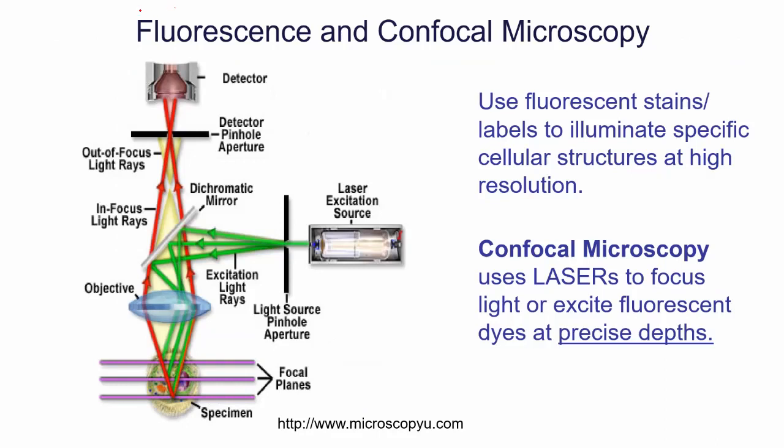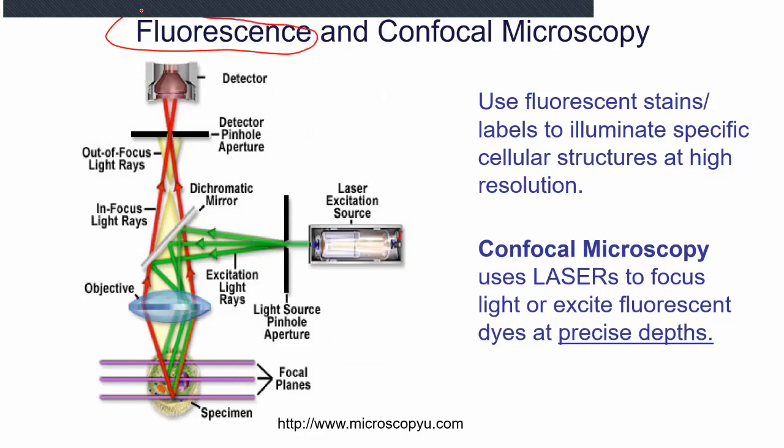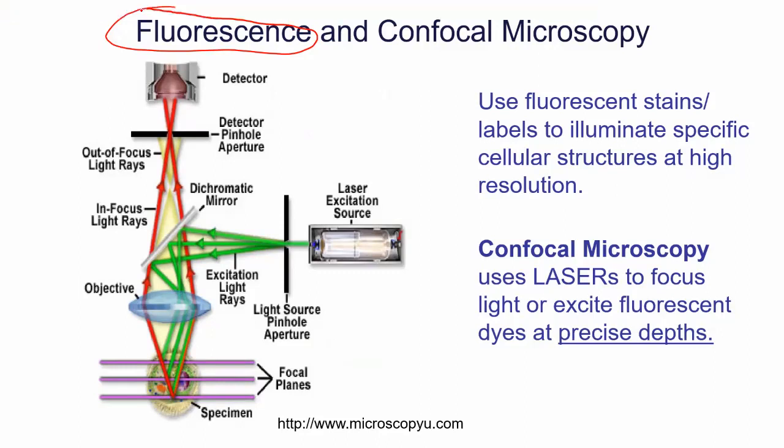I'd mentioned we have our staining, right? And so what if you had a stain that actually glowed? That's what fluorescence is. You hit something with some light, and usually another color comes off and it glows. So now we can have glowing samples, and we can get some really stunning, amazing images.